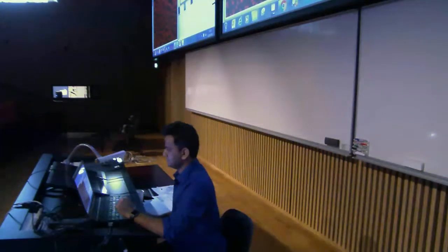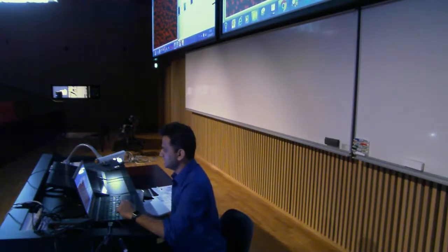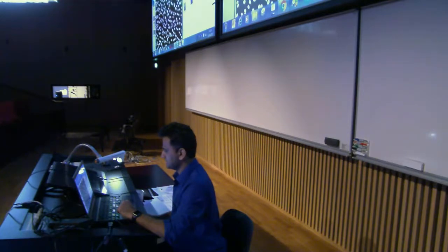See the effect of thresholding? No? Because if I select everything, then everything will be selected. So it doesn't make sense. So I'll go for this one. Then I say apply. But now see the problem. The problem is that these are two nuclei, but because the threshold was not good enough, it has become one.